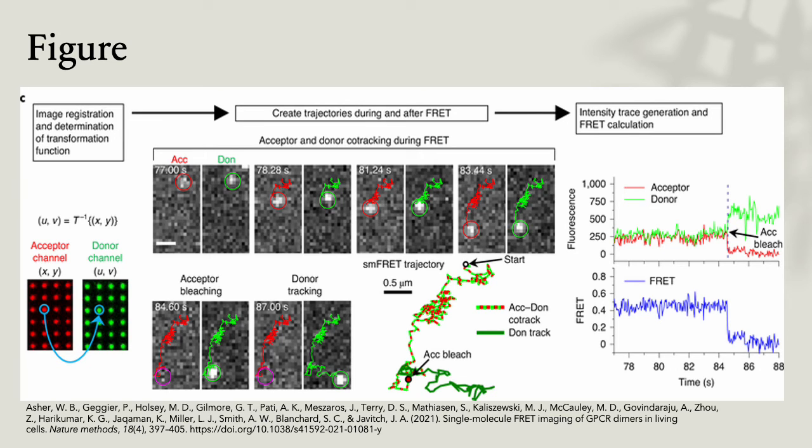And so from this, you can theorize that with only donor excitation, it's observed that the acceptor's intensity coincides with that of the donor, indicative of the detection of receptor complexes by SM-FRET. Donors without colocalized acceptors are consistent with the stochastic labeling approach employed, in which a population of dimers labeled with 2 donors, or only 1 donor and no acceptor, is possible.